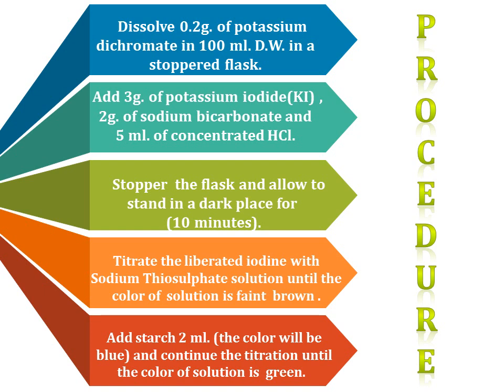النقطة اللي بعدها add 3 gram of potassium iodide. Potassium iodide راح نستخدم excess amount of potassium iodide، يعني هذه 3 غرام تعتبر excess amount of potassium iodide، to be sure that all amount of potassium dichromate اللي هي الأوكسيدايزنج agent reacts with potassium iodide, reducing agent, and produce iodine. مثل ما ذكرنا بالfirst equation in the chemical principle of the standardization of sodium thiosulfate solution. كان عندي البوتاسيوم dichromate oxidizing agent, potassium iodide reducing agent in the presence of HCl acidic media for redox reaction راح يتكون عندي الأيودين.